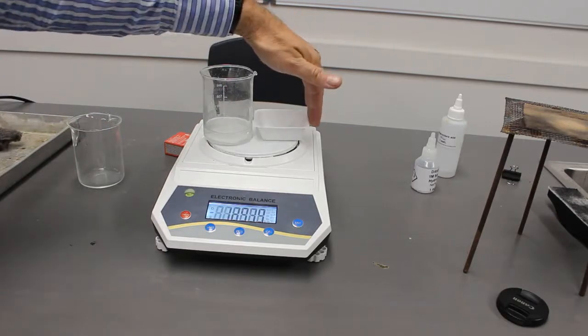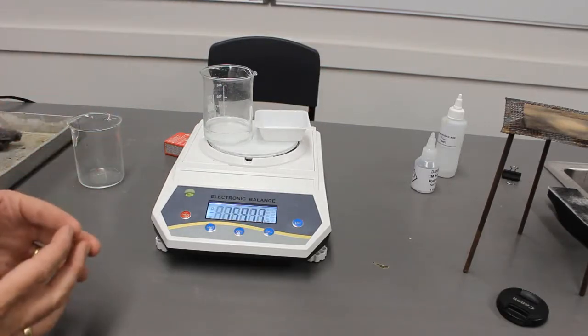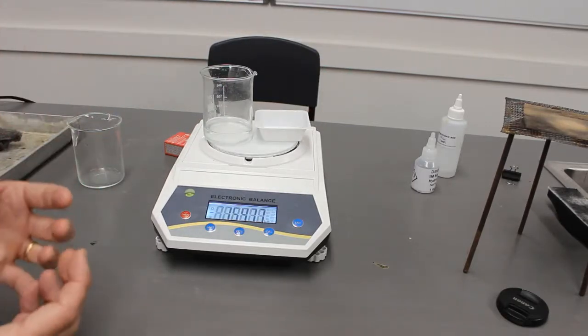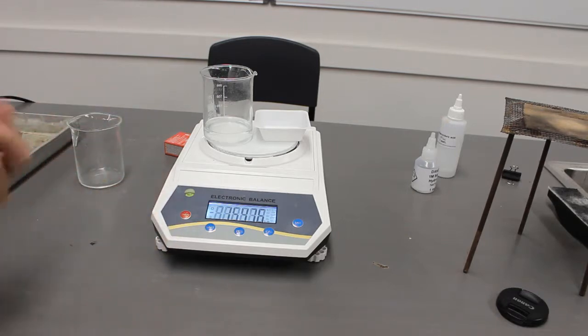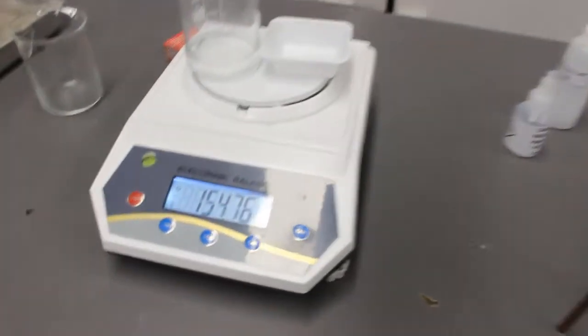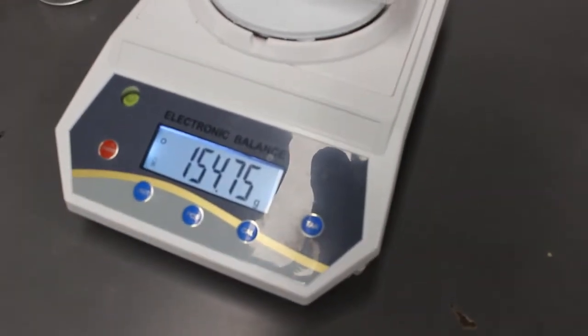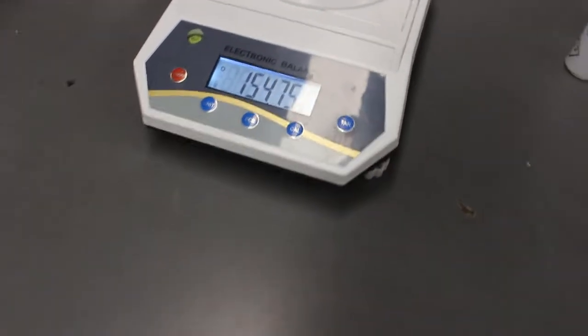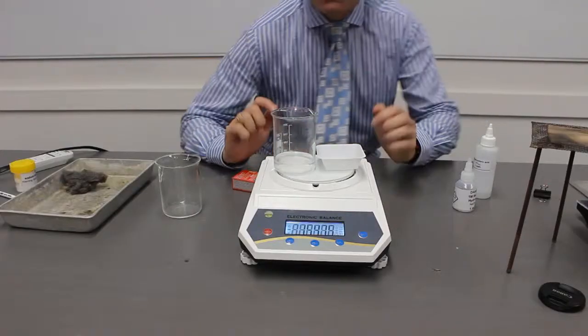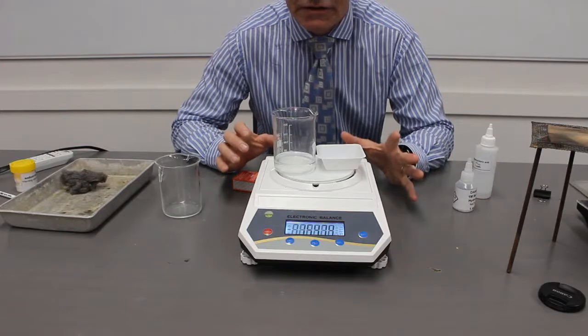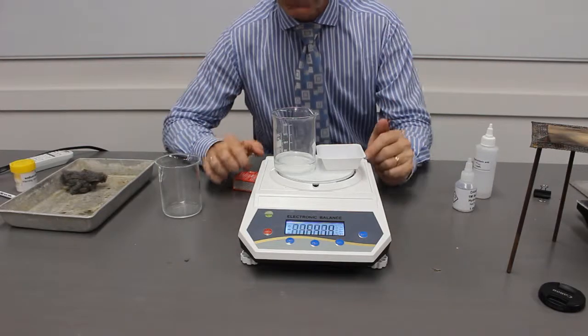So we can see that fizz means that bubbles are being produced. And those bubbles are gas. So let's have a look at the mass now. 154.75. So we've actually had a reduction in mass. So the mass has actually decreased. Why has it decreased?